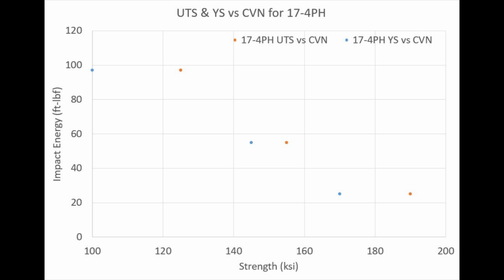So I hope this video was informational and instructional in understanding what impact toughness is and how it's measured, at least in metals, and how it's important for design considerations even if you can't actually design with Charpy impact values in the first place.